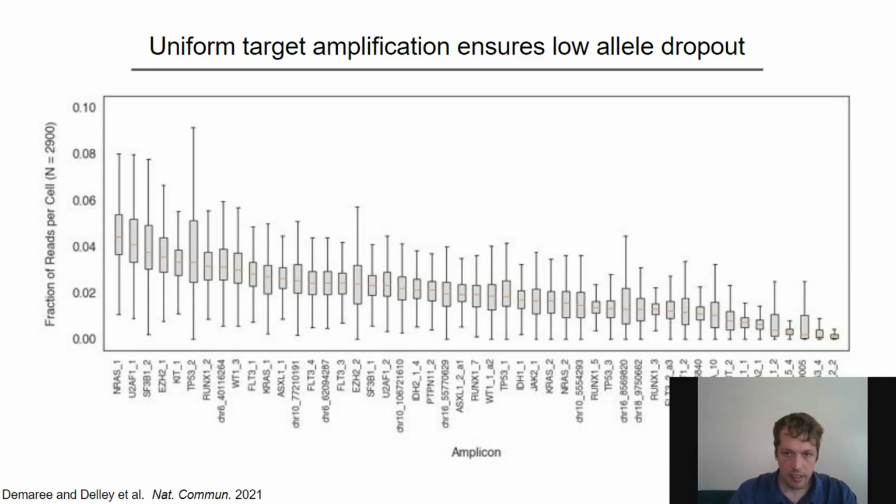So what does that give us at this point? Well, that's exactly the same thing as what people would be doing if they do bulk sequencing, targeted bulk sequencing of cancer cells. But through the barcodes, we have this now at single cell resolution. And I guess for those of you who have heard of Mission Bio, which is a startup coming out of the Abate lab, they basically recently commercialized this microfluidic workflow as what I have described here.